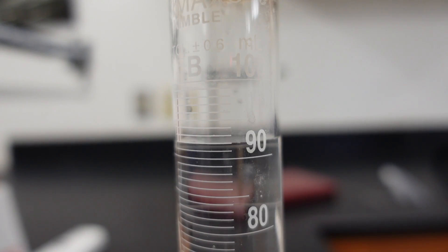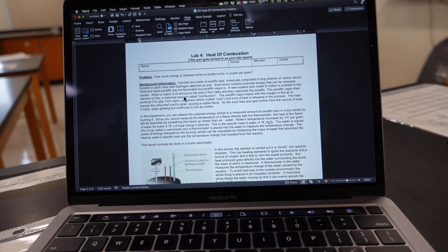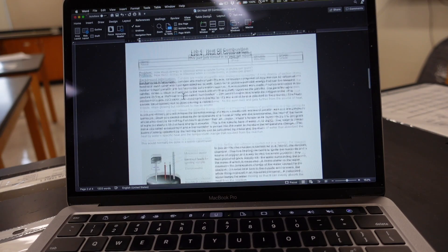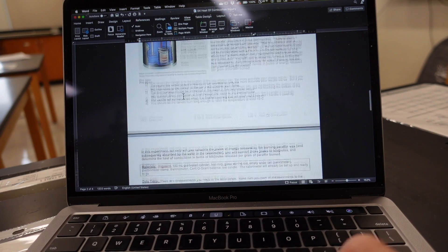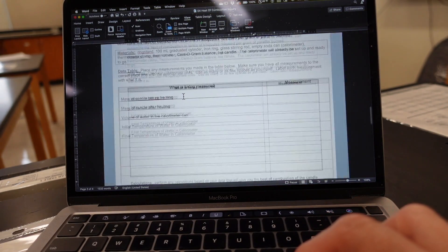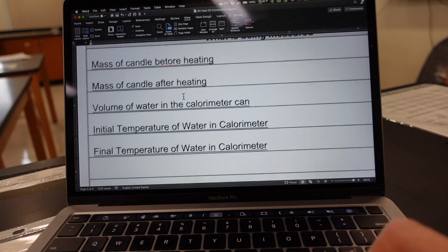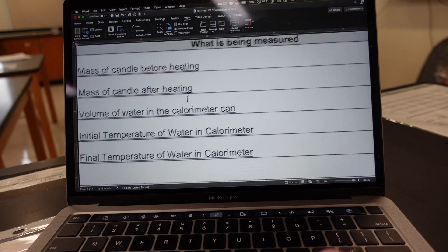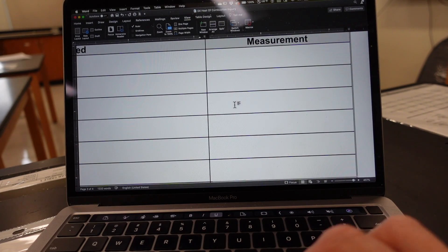Okay, go ahead—record the volume of water that we're going to put in the calorimeter cup. And here's where you do it. If you look at your lab, there's a data table and right here on your data table is a place to put the volume of water in your calorimeter can.